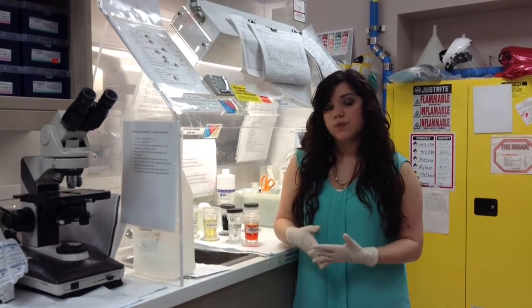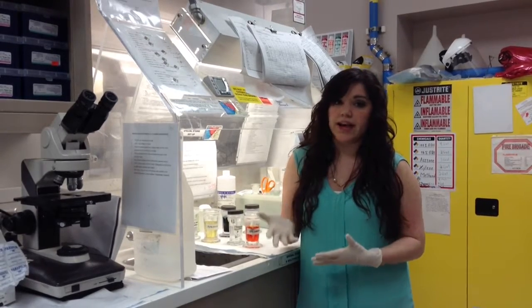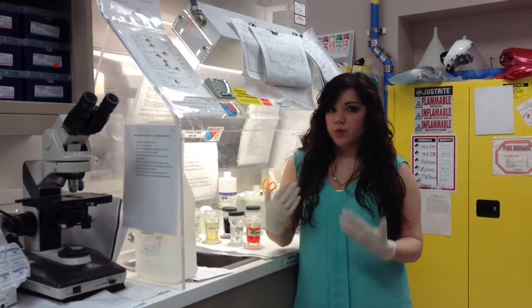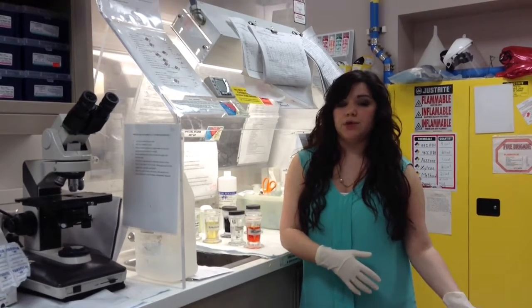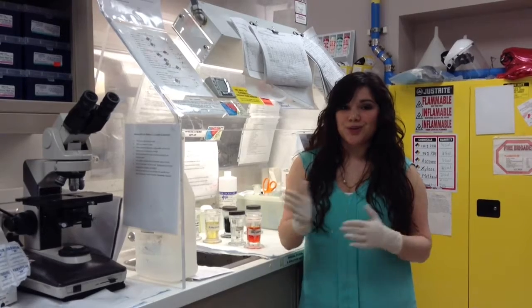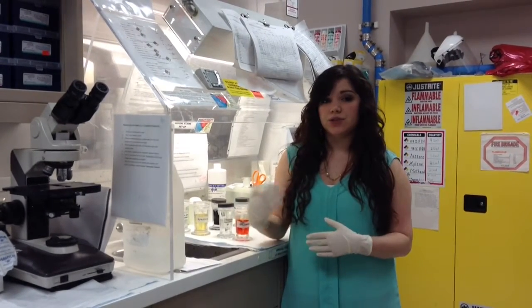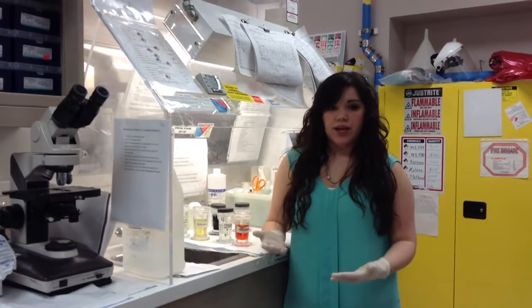They can perform the procedures on control slides, but it's preferable to lump it together with work that they actually have to perform in their daily workload. So you will likely process a few bronchial specimens with the student and then escort the student down to the Special Stains Laboratory. Be sure to show the student how to get back for whenever they're finished, and then they'll return with you. You can still practice some more finalized bronchial fluids, especially if you don't get any new current cases. That's okay to do with the student.